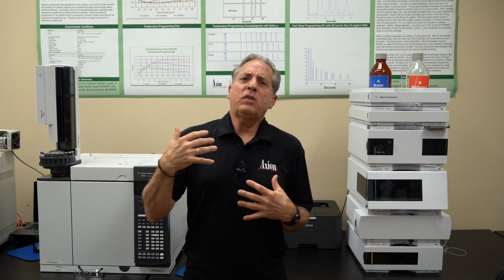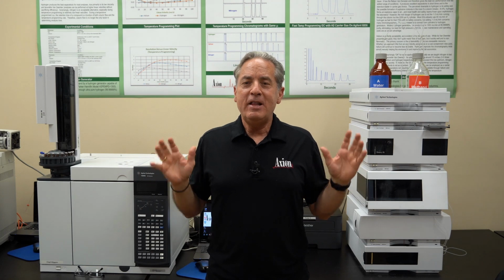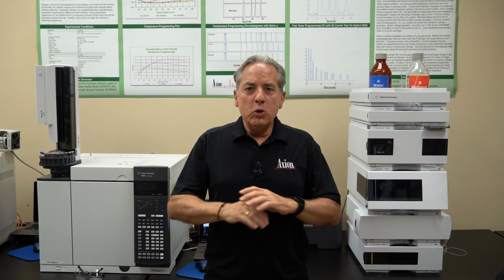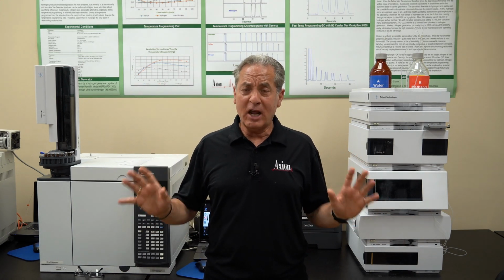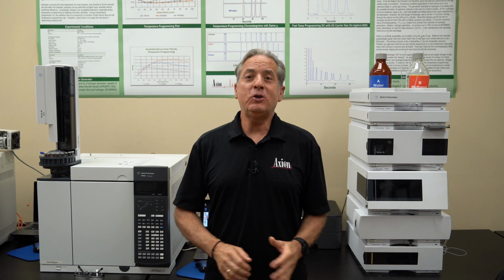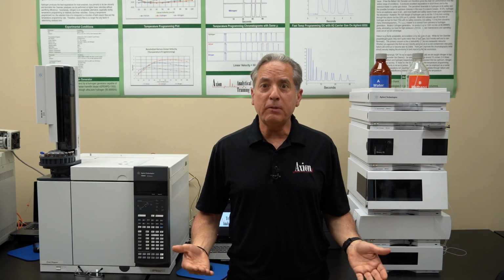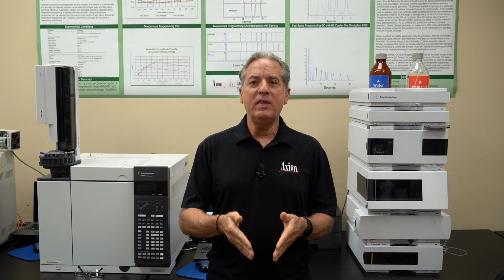Then we'll play around with different column lengths and diameters. You know, I have this really cool concept that if you cut the diameter in half and cut the length in half, you'll get the exact same efficiency as your original column. But the retention times are all cut in half, which means you could take any application that currently works, and cut the analysis time in half simply by cutting the length and diameter in half, and we're going to prove that to you by actually doing that here in lab.